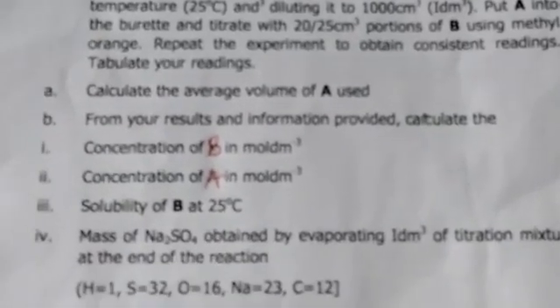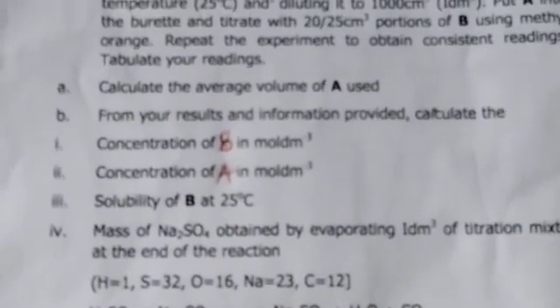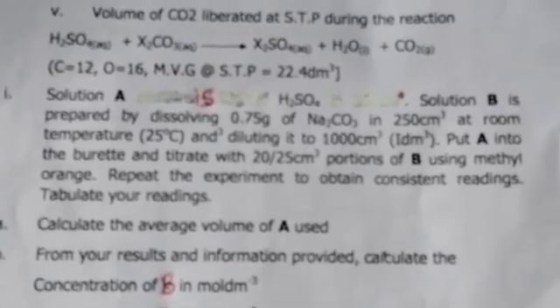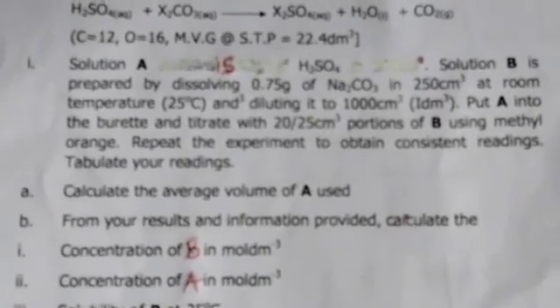We're going to question B that says from your result and information provided, calculate the concentration of B in mole per dm cube. So we'll look for a clue in the equation. We have solution A is H2SO4. Solution B is prepared by dissolving 0.75 gram of sodium carbonate in 250 cm cube at room temperature and diluting it to 1000 cm cube or 1 dm cube. So we're going to use this clue to calculate our CB.